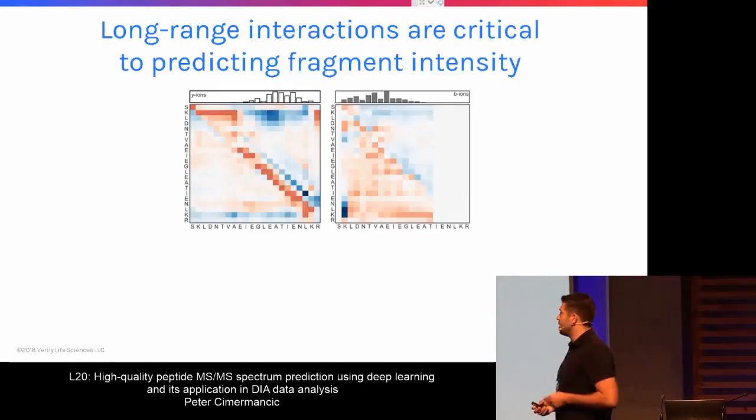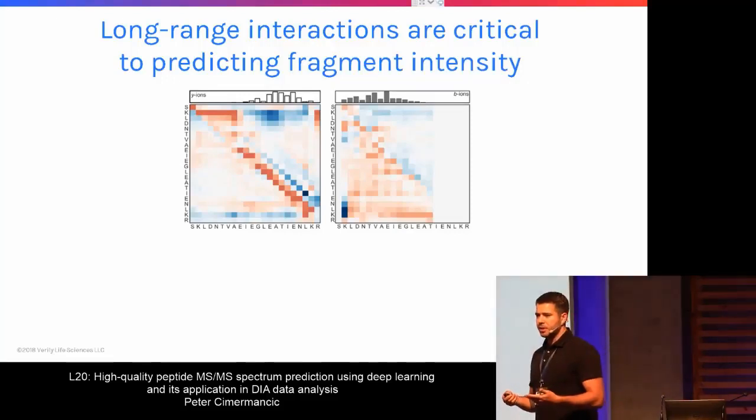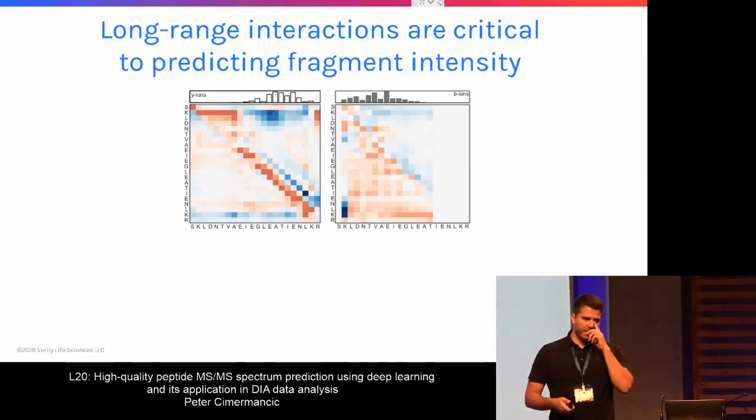So we first ran that on one single peptide example with this sequence. And you see here the attribution heat map for both Y and B ions. Just as an example, if you focus on glycine over here, you can see how the fragmentation efficiency or peak intensity at that position is being affected by all other residues within that peptide sequence. The blue here is a positive attribution, meaning that they increase peptide fragmentation. And the red one is negative attribution, meaning that they decrease fragmentation efficiency.